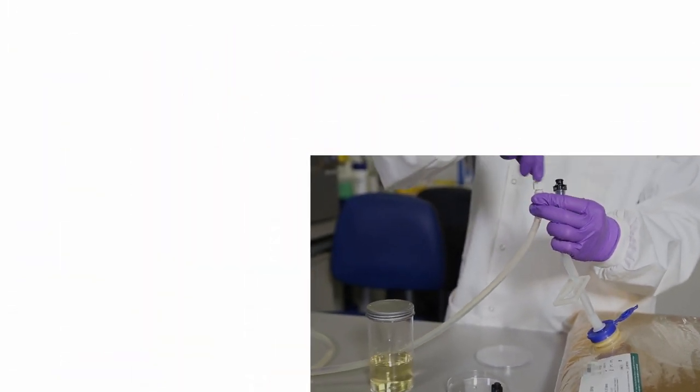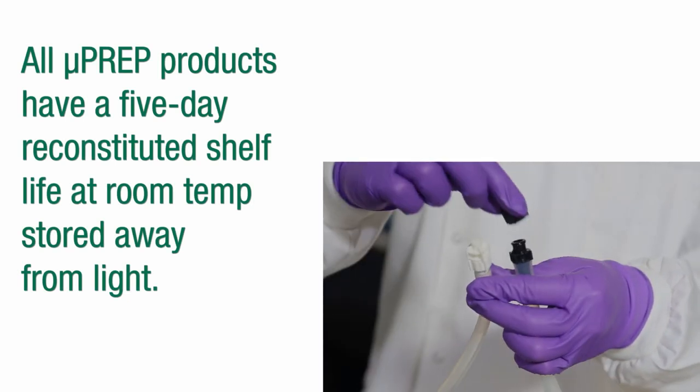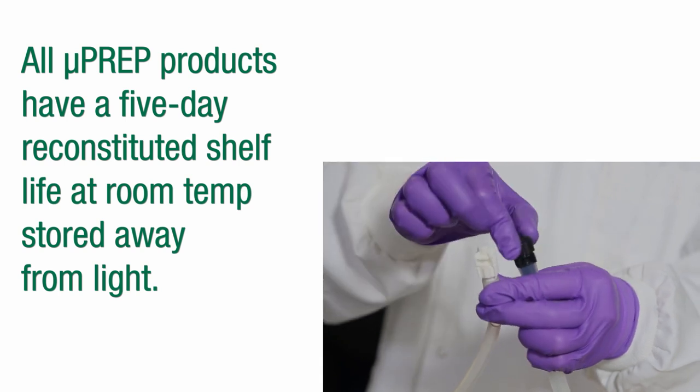The entire Neogen range of MicroPrep ready-to-reconstitute bags have a five-day reconstituted shelf life at room temperature when stored away from light.